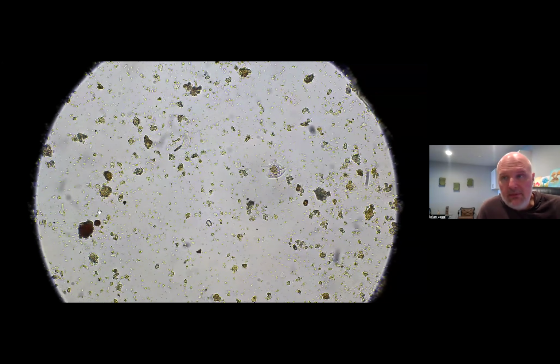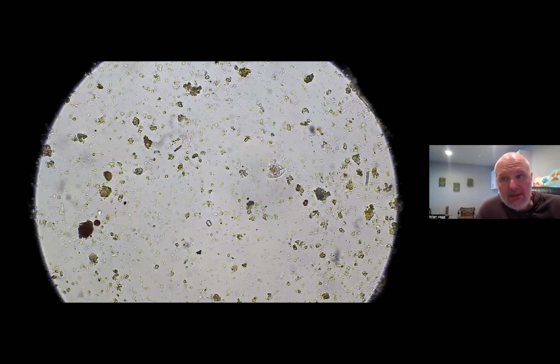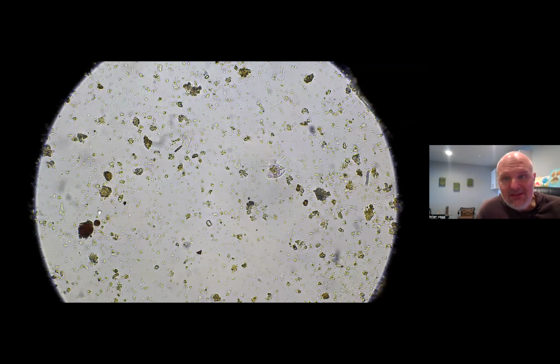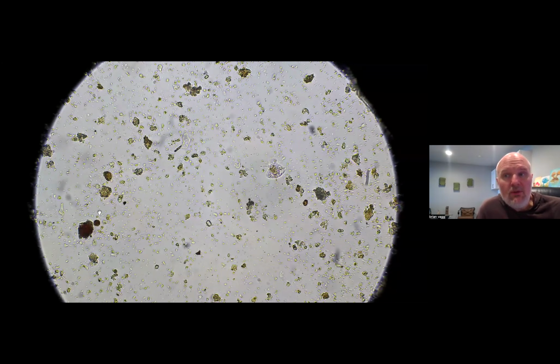And if it's not, then I've got to figure out why. Did I just mistreat my compost? Did I not keep it watered? Did I leave it exposed? Was there some kind of contamination that was applied to the soil? So, hopefully, it gives you a picture of how you could use the actual tool itself, the microscope, to give you a lot of really good information.